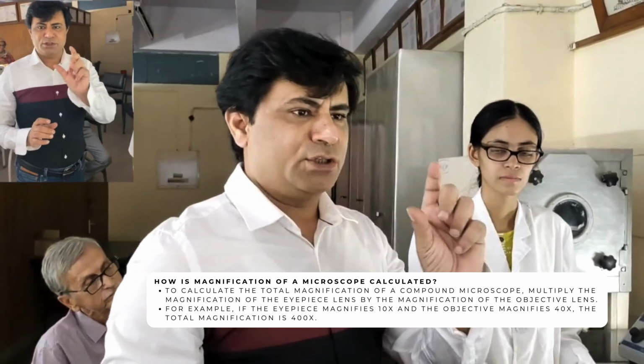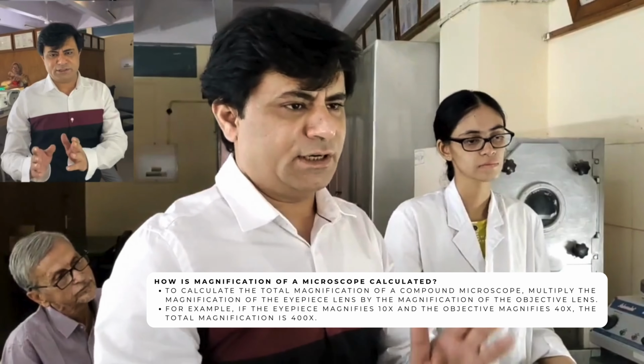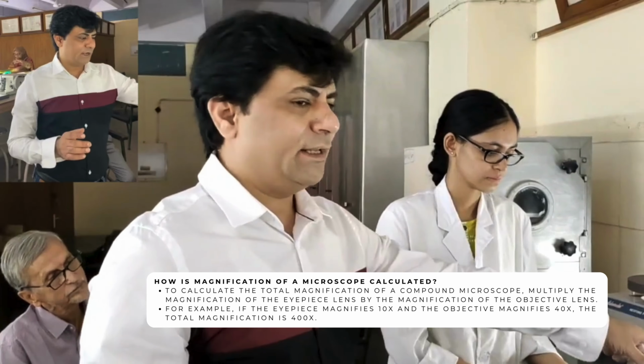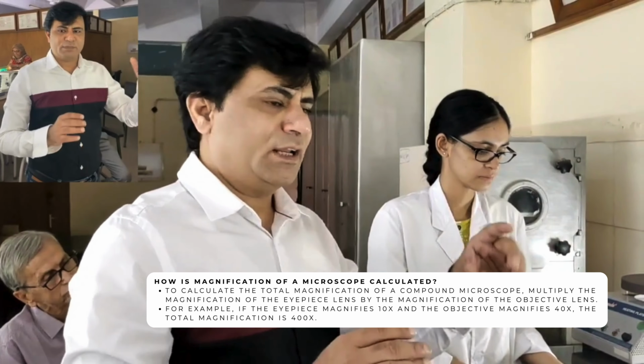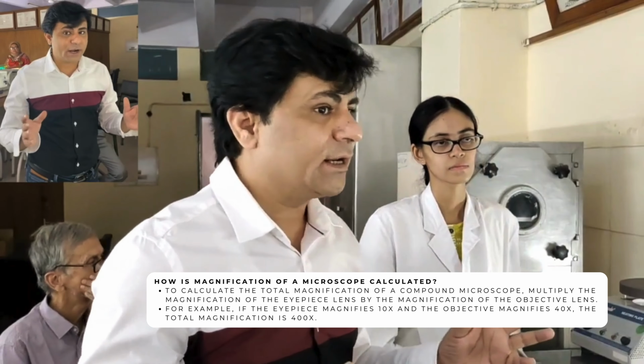One thing about magnification is it's very easy to tell you that whatever is the magnification of an objective, you multiply it with the magnification of an eyepiece. Like if it's a 10x and 10x, that makes it 100 times magnified. If you're using a 40x objective and 10x eyepiece, that will magnify it 400 times.